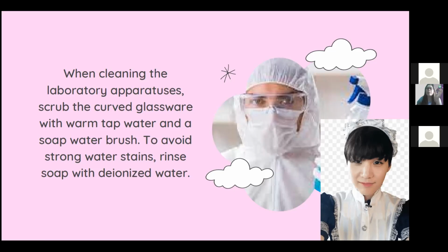The ideal one is to use lukewarm water. Not really yung mainit masyado na water, pero yung medyo warm lang. Okay?